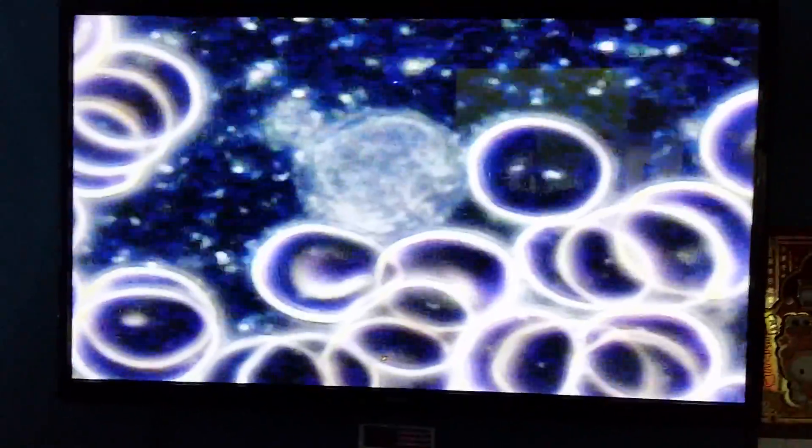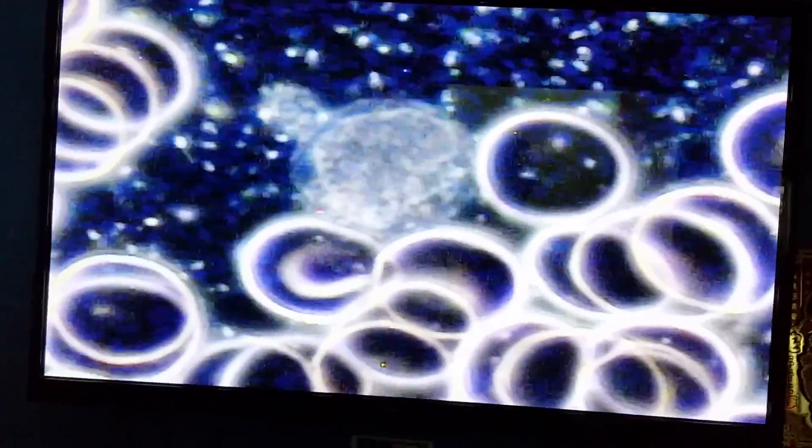Lymphocytes are white cells that fight viruses. In the dark field microscope, since we don't use any stain or chemical, we cannot really see the viruses. We can see some bacteria like spirochetes or mycoplasma, but the viruses we cannot see. However, there is an indication that this is fighting because this is the cell and this circle around is called viral encapsulation, which means it captures the virus and kills it. It can be as simple as cold flu virus, Epstein-Barr virus that makes us tired, Coxsackie virus, it's also in the air.